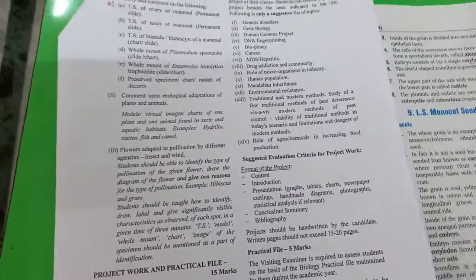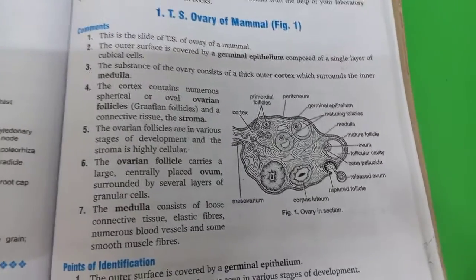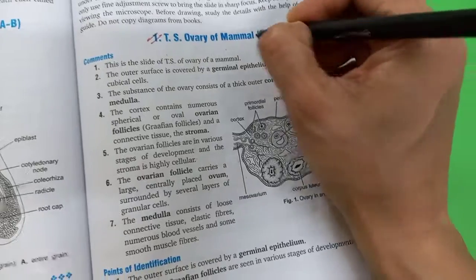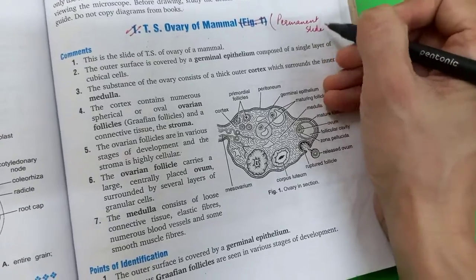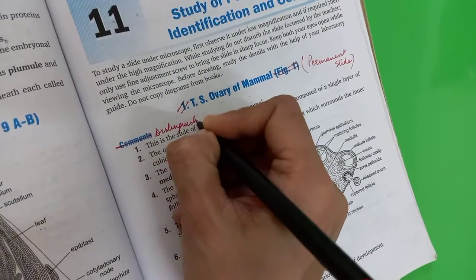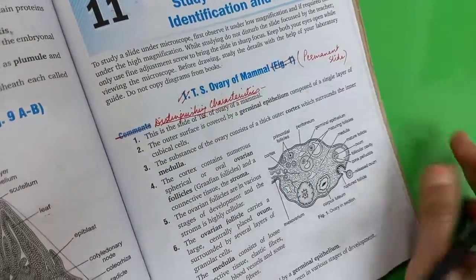So let us understand how to describe this in your practical books. This is page number 117, right? You will directly draw this diagram with your heading. Please don't write any number. Your heading will be TS of ovary of mammal. No figure number, children. In the bracket, you will write permanent slide, and this will be underlined. Then instead of comments, please write distinguishing characteristics. So this will be your heading after one line, distinguishing characteristics.